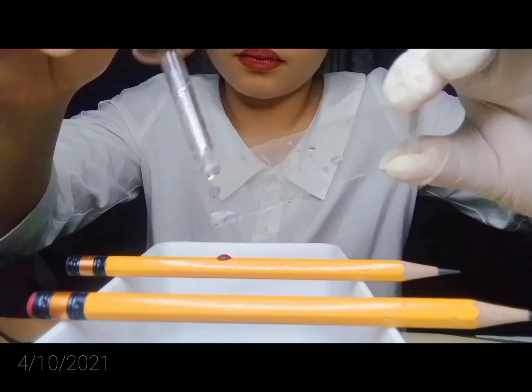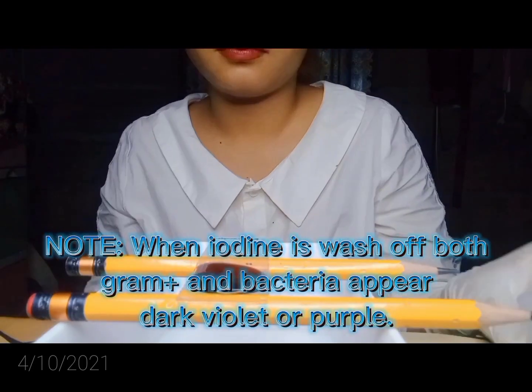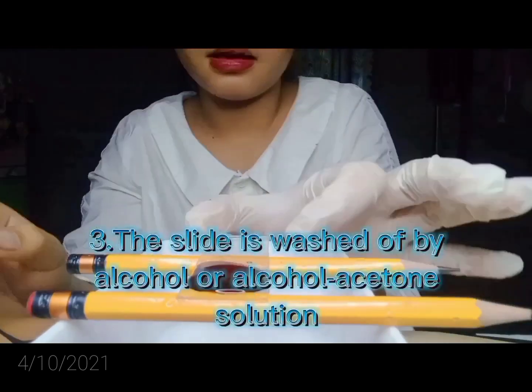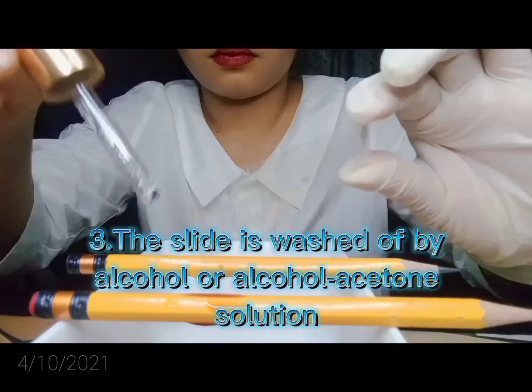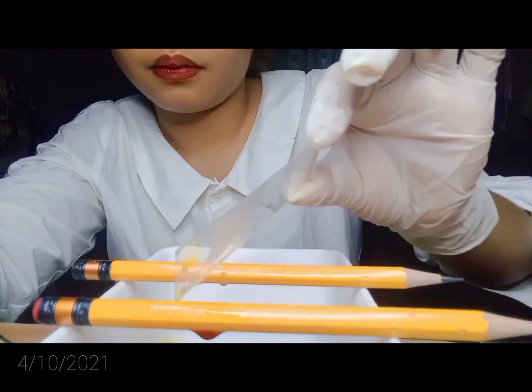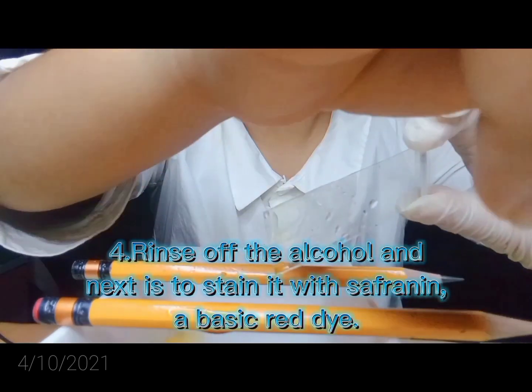Wash the slide gently with distilled water. Cover the smear with iodine. Iodine is washed off, and both gram-positive and gram-negative bacteria appear dark violet or purple. Third, the slide is washed off by alcohol or alcohol acetone. Fourth, rinse off the alcohol, and next is to stain it with safranin, a basic red dye.